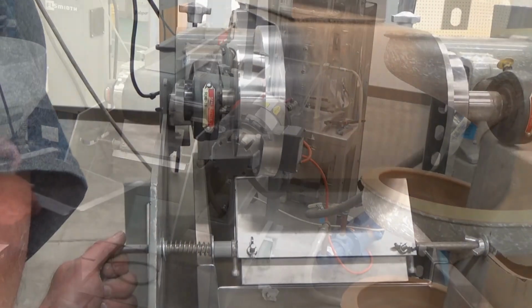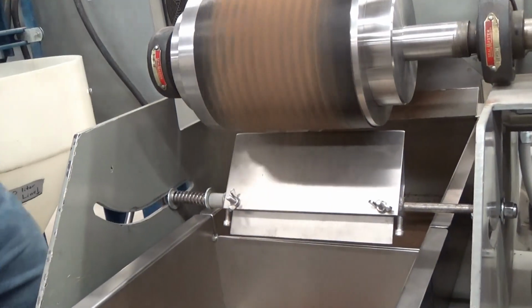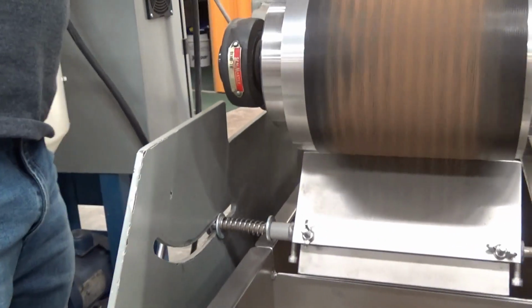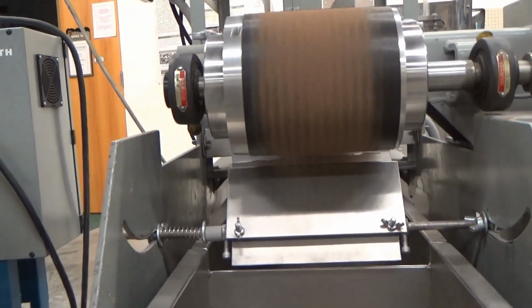Yeah. So the magnet makes things stick to the belt while it goes around the roller. I might slow this down just because I'm getting some carryover here. Sure. There we go. Yeah, that's better.